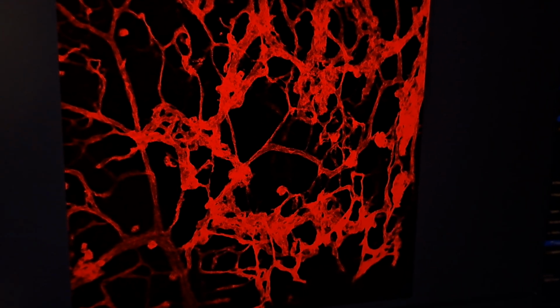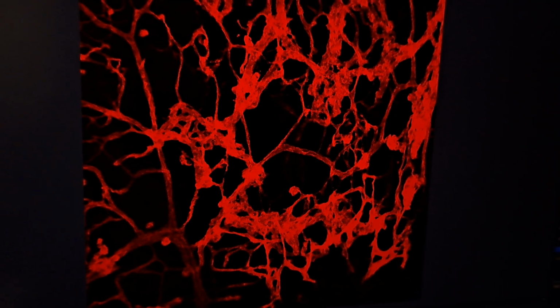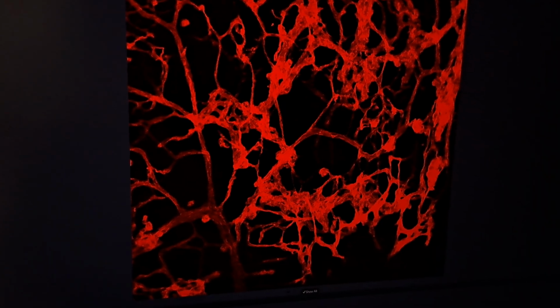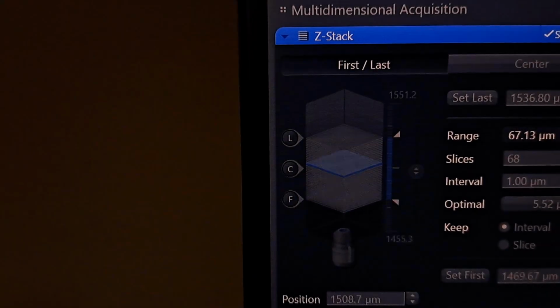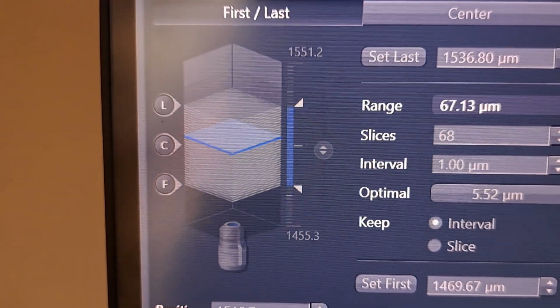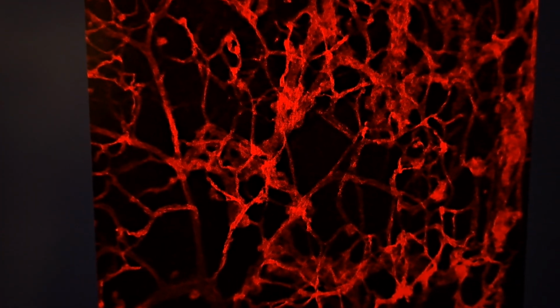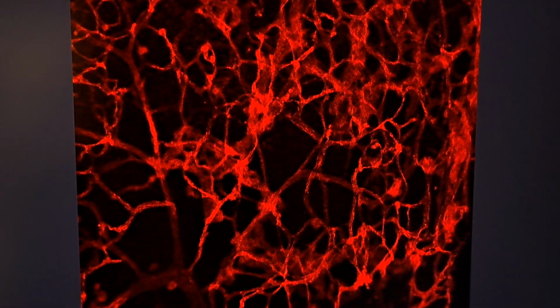This is the neovascular model and the mouse OIR model. So that's about just past halfway done. See the progress here on the scan. The little blue plane is moving up or deeper into the retina tissue. We'll end up saving a complete Z-stack image.